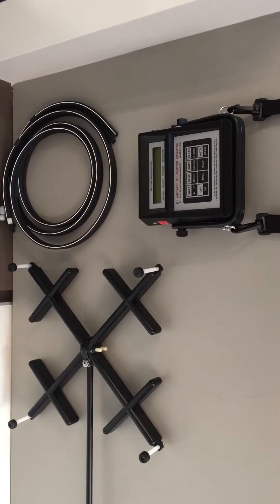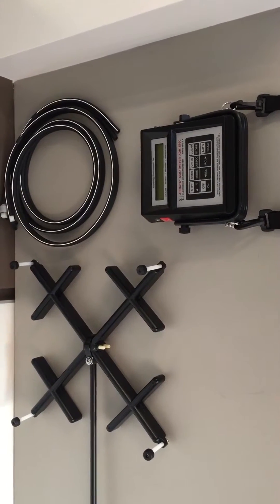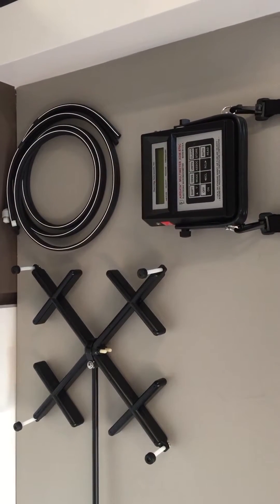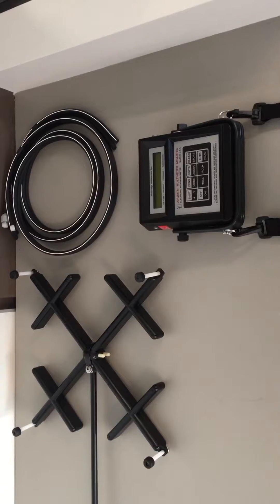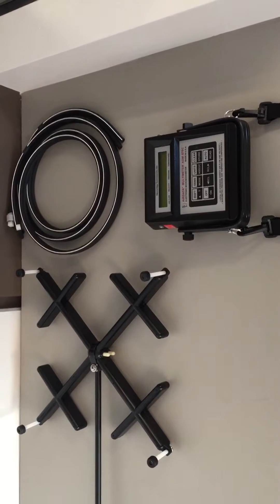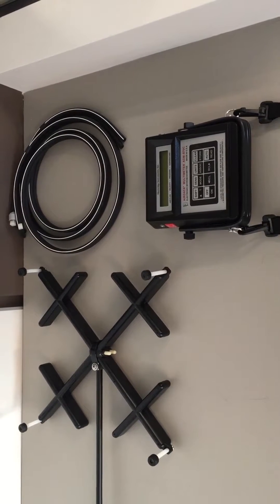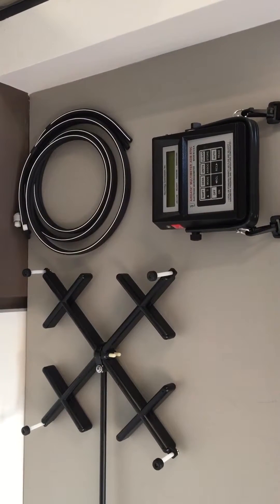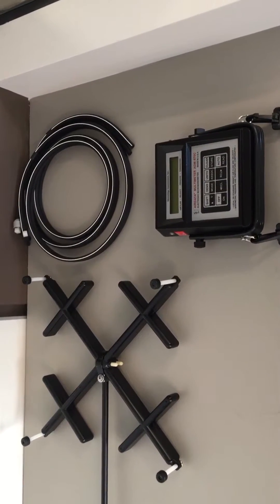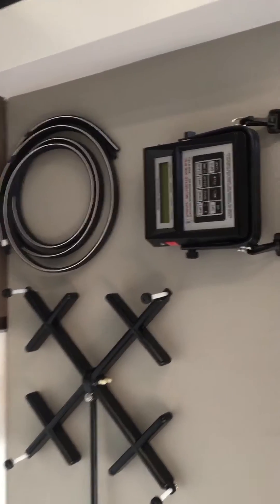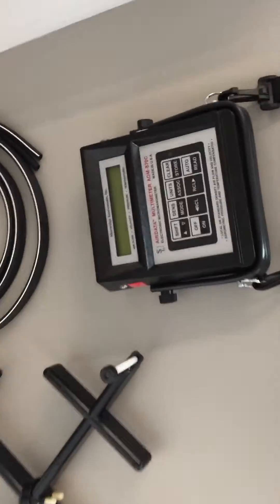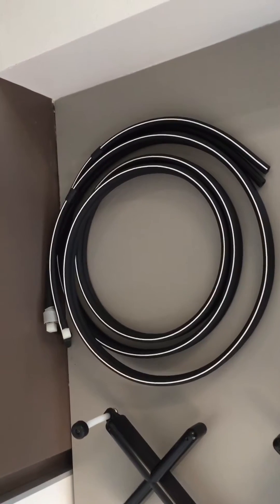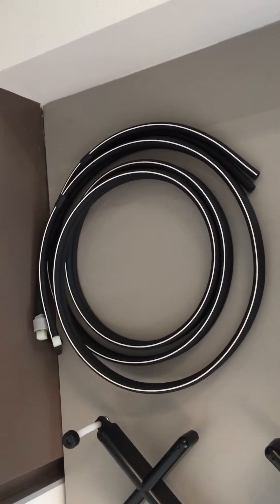Today we'll be taking an air velocity measurement using the AirData Multimeter by Shortridge Instruments. The equipment needed for this is the AirData Multimeter terminal and the tubing to attach it to your Bell Grid measurement system.